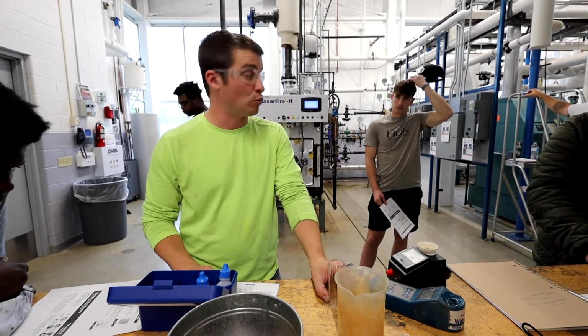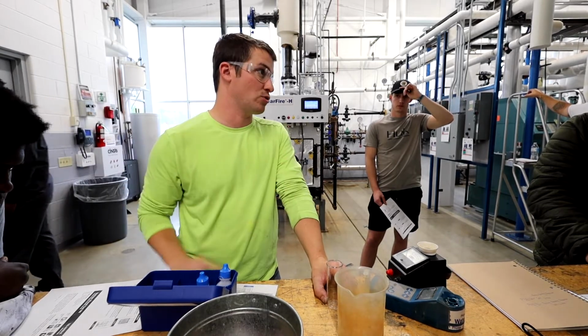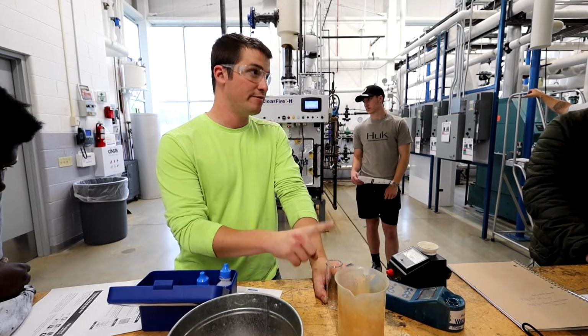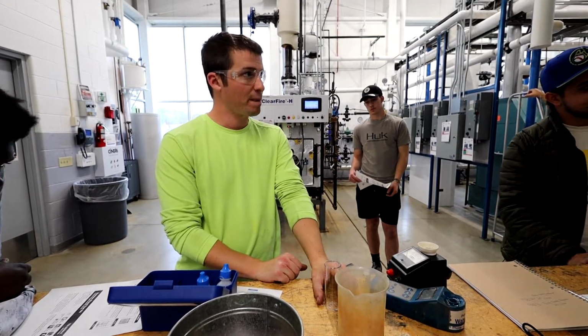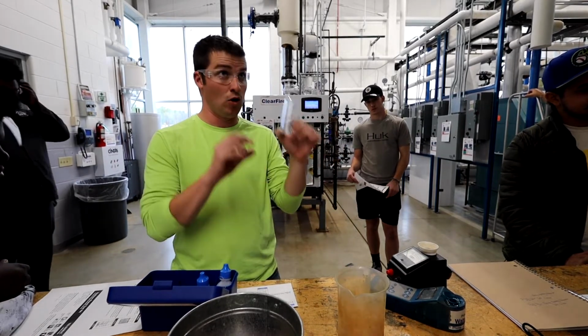If it would have turned blue after 1 drop, that would have been 0.5 parts per million of hardness, I would say that's okay. Mm-hmm. It turned blue at 4.5, or after 9 drops, that's too much. Okay. So that is a problem that we'd want to try to address in the boiler. All right. So that's where we're at right now. Yes. 9 drops? Yep. We had 9 drops in, and we know that's too much.